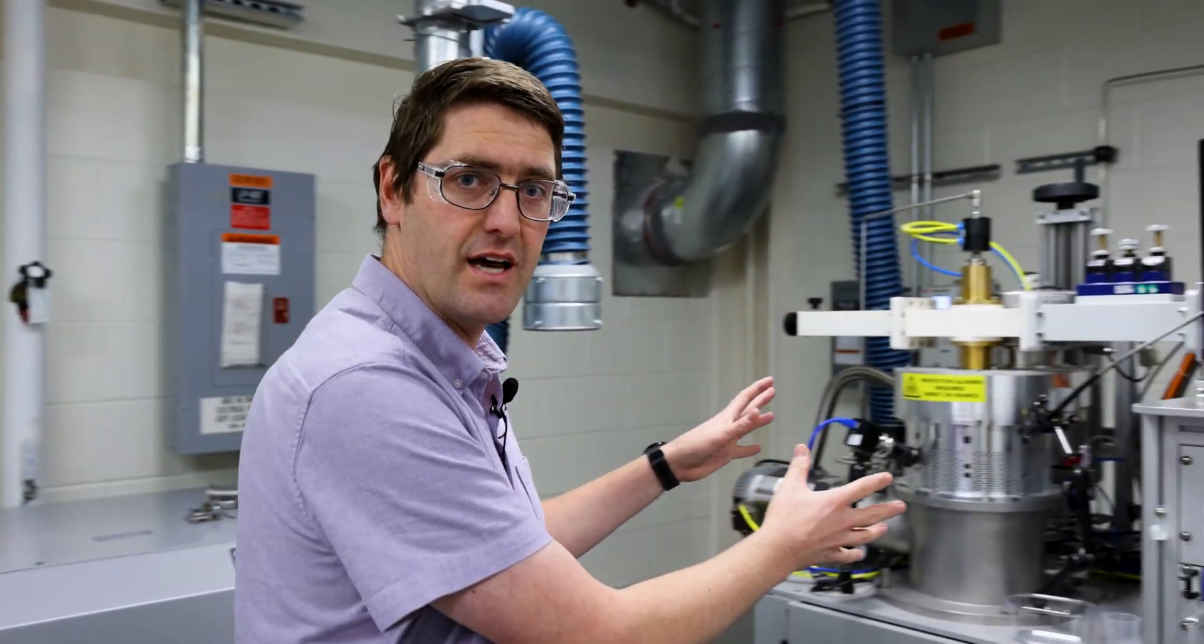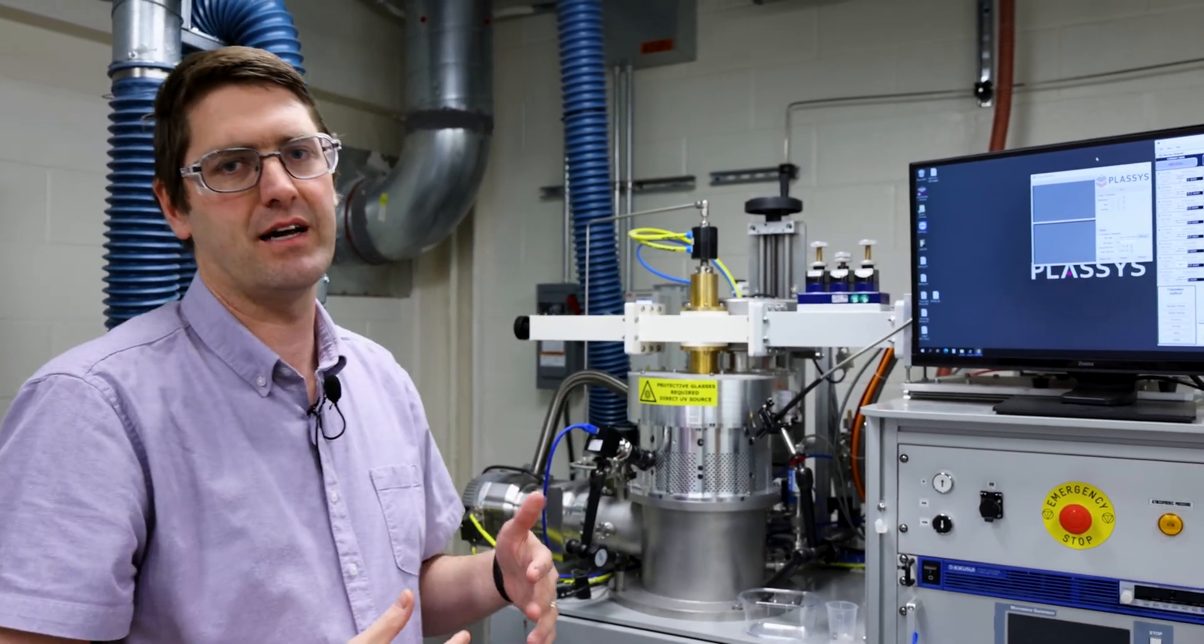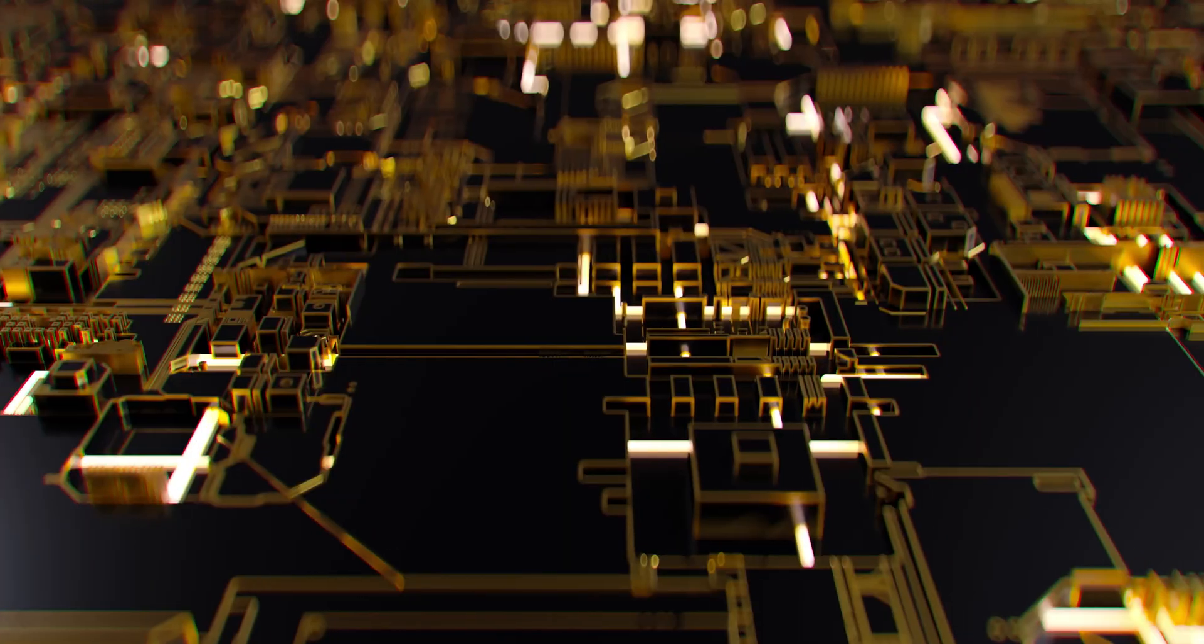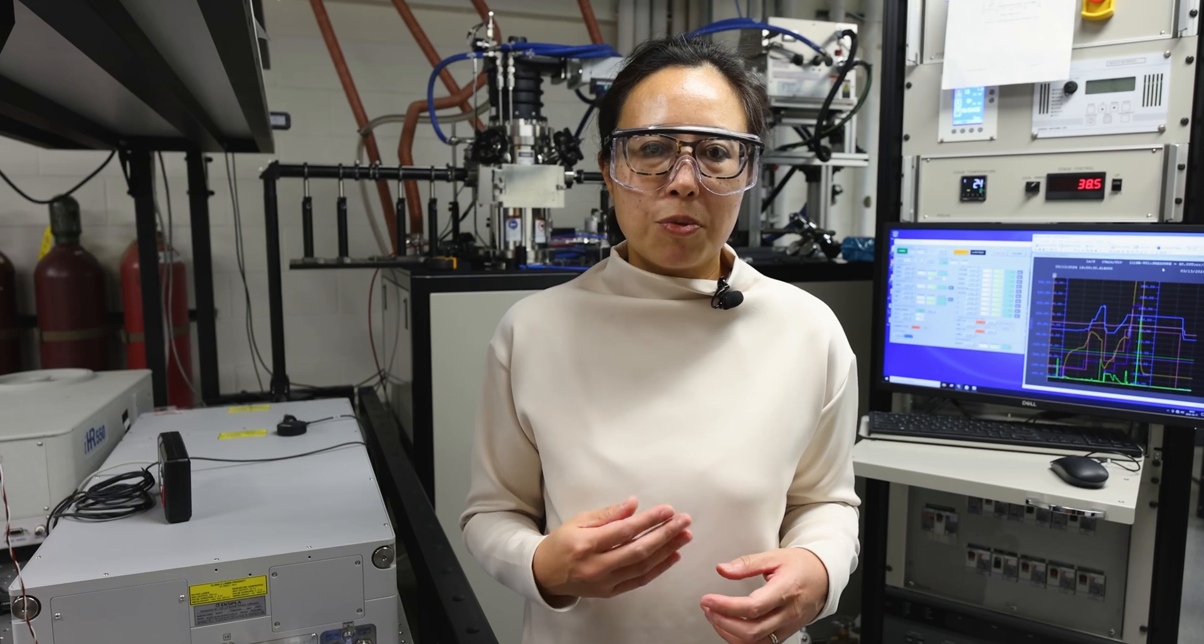In the second machine, we're deliberately adding different dopants. It looks the same, but we have different gases flowing in. We're deliberately doing that to change the properties of the diamond. When we combine these two things together, we can make some really interesting quantum and microelectronics devices. This is a critical step forward in making sure we have domestic capabilities to grow state-of-the-art material.